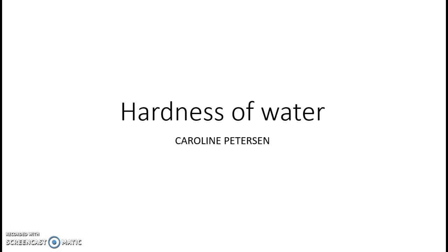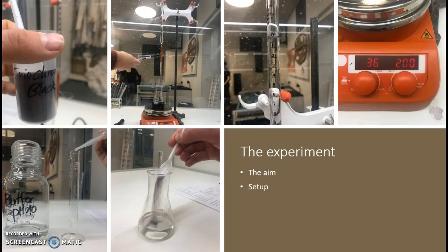In this video I'm going to talk about the experiment and the calculations and just hardness of water in general. So we set up this experiment, and the aim of the experiment was to figure out and calculate the amount of calcium and magnesium in tap water as well as in boiled water. We wanted to figure out the hardness, the temporary hardness and the permanent hardness of the water.